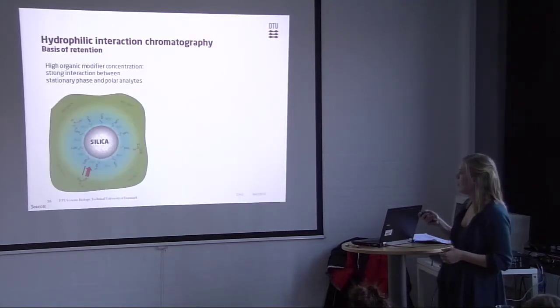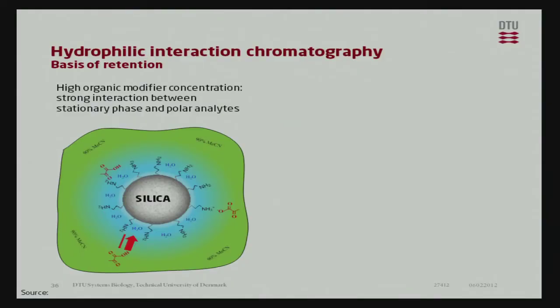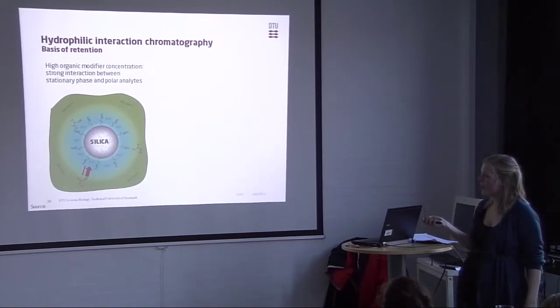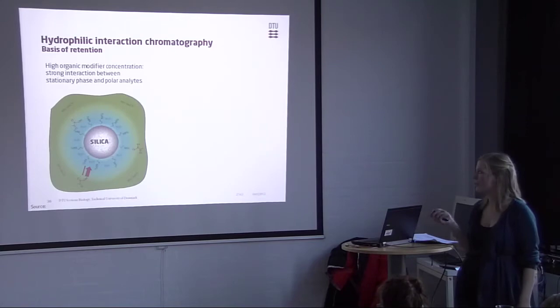So when you use hydrophilic interaction chromatography, here you have an amino phase and you have all that water bound in between the amino groups sticking out from the silica. That means that when your mobile phase has a high organic content, so when you start out with acetonitrile, for example, the polar compounds are not fond of acetonitrile. They'll go in and hide here in the water layer. They'll stick to that water layer, or the stationary phase, and the mobile phase with high organic will just pass through and let them rest there for a while.